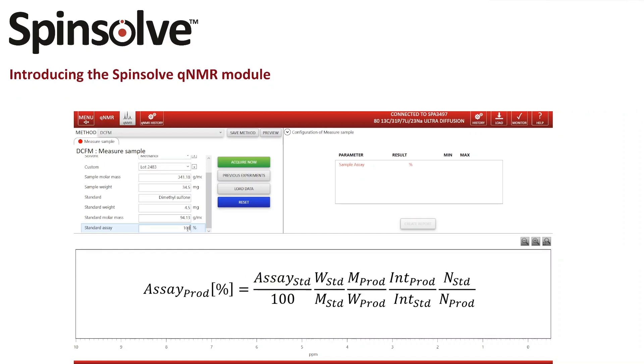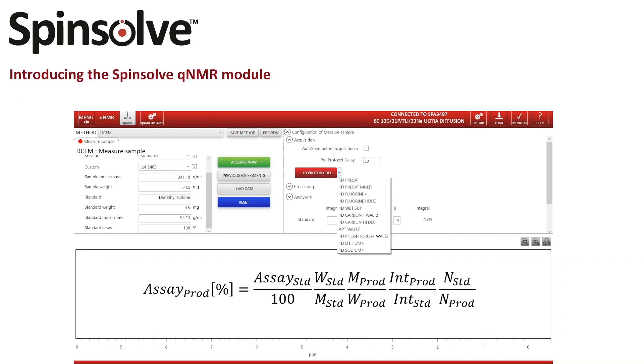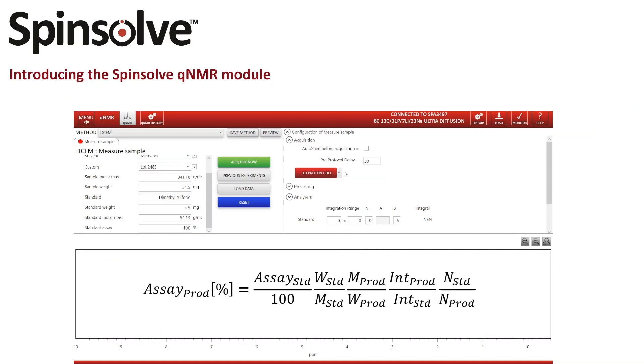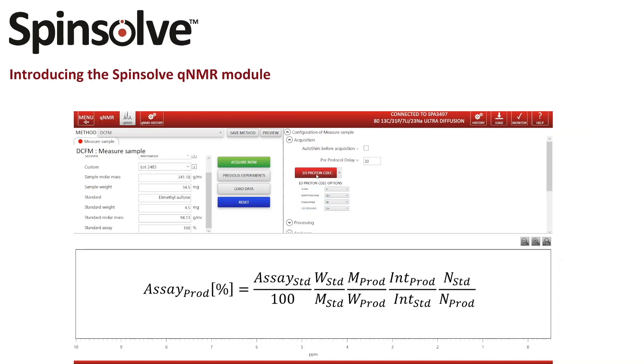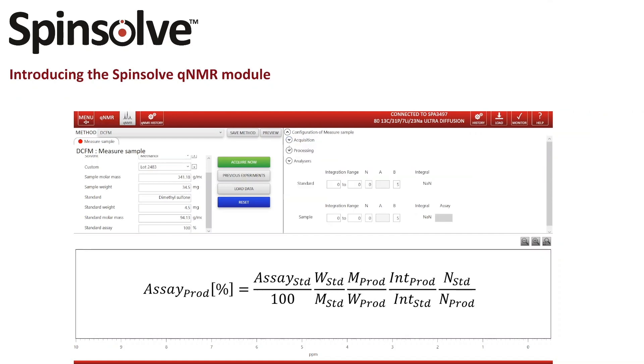With this complete, I can configure the acquisition and processing parameters. Depending on the configuration of my Spinsolve, I can choose from a variety of available protocols for my QNMR experiment. For this sample I'm using a proton experiment with carbon decoupling, 4 scans, and a repetition time of 30 seconds. I can also include a shim before the measurement and define a delay for the sample to equilibrate before the measurement. Since I already inserted the sample into the Spinsolve, I can set the delay to zero.